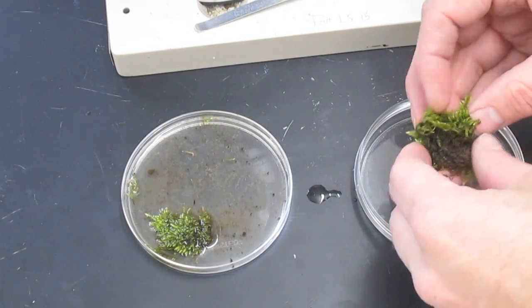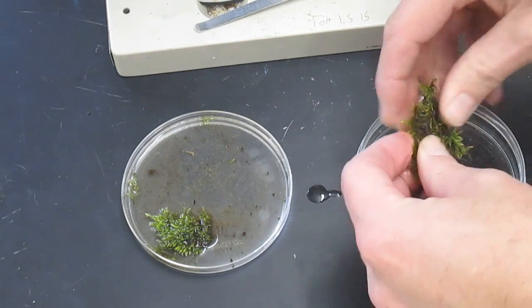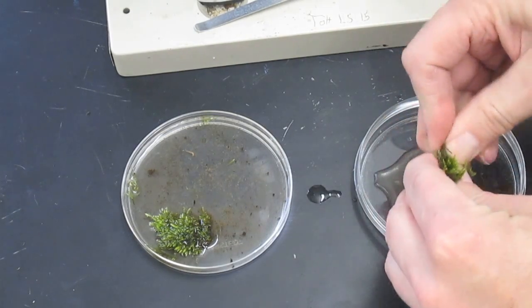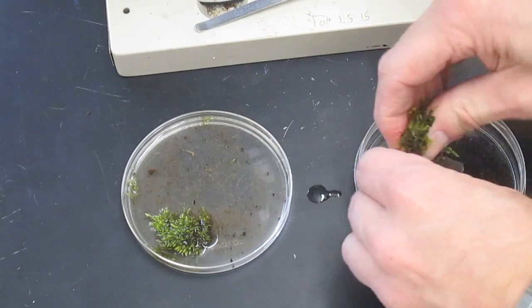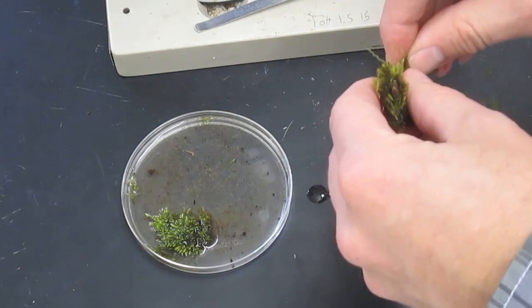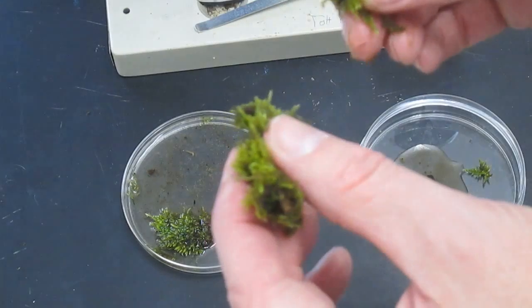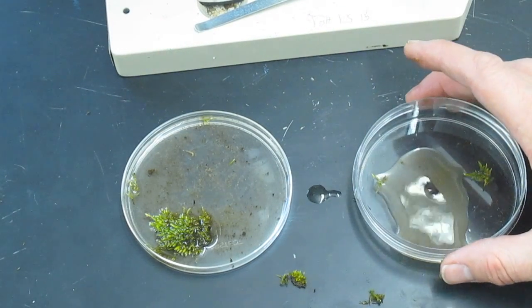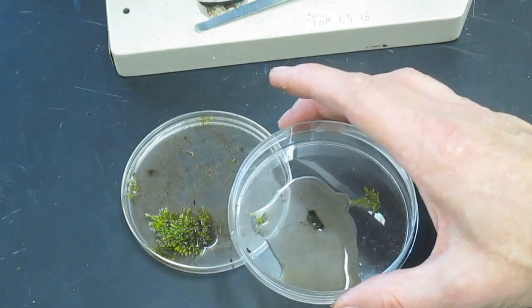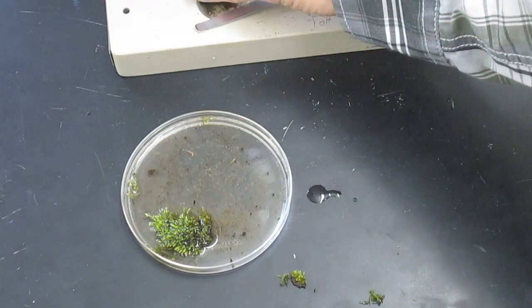Squeeze the moss as hard as you can to try to get all the water out of it. You're not going to squish any bugs by doing this. If a little bit of moss falls in, that's okay. Throw away the wrung-out moss, take the water that's been squeezed out of the moss, and put it under a dissecting microscope.